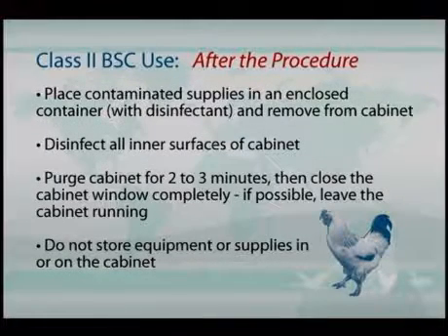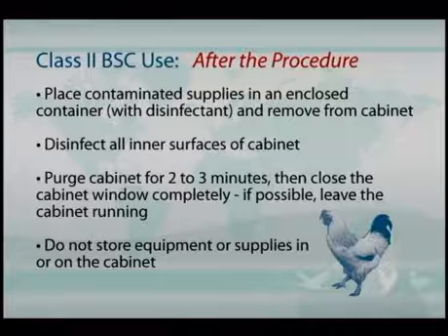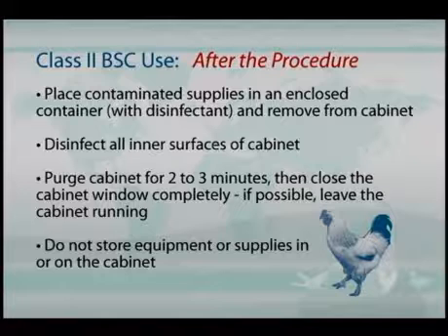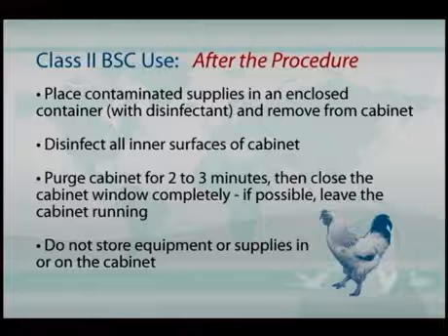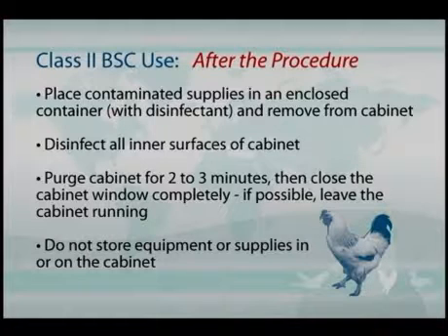And then after you're finished, of course, you have to safely remove any materials that you have within the cabinet, and these should be disinfected before they are removed. And then the inner surfaces of the cabinet should be thoroughly disinfected as well, so that it's clean and the next operation can be started within just a few minutes. And if you're going to use a cabinet intermittently throughout the day, it is recommended that you just leave the cabinet running instead of turning it off and on as needed.